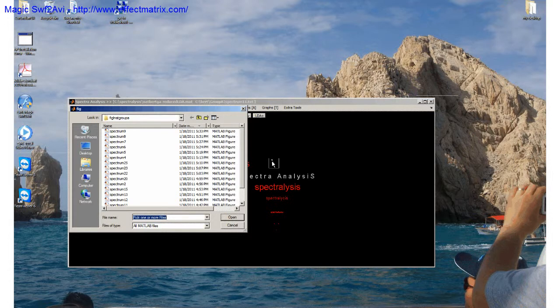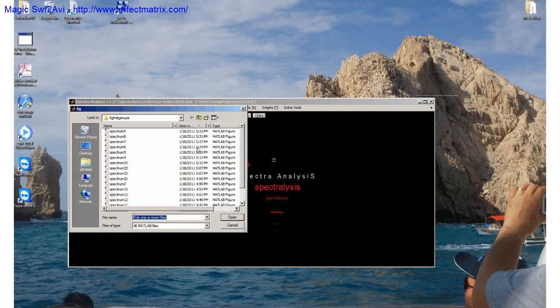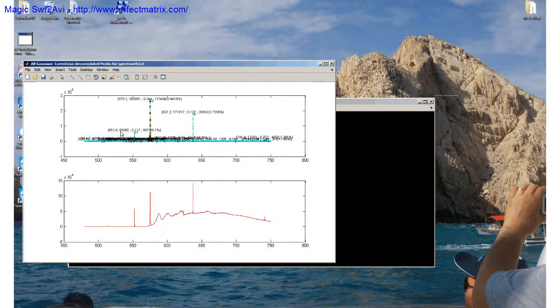But I'll continue. I did it by hand. I separated them into group A and group B. So the results I got in group A are these. You can see the dates here. At 5:33 was the last one, 5:31 p.m., 5:27, 5:24. This is more or less the time it took for every sample to be processed. Let's open any of them to see results.